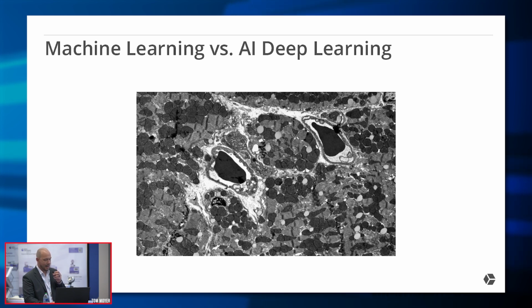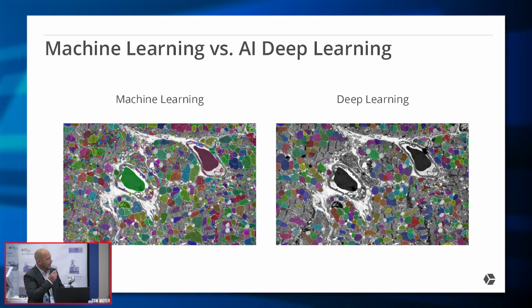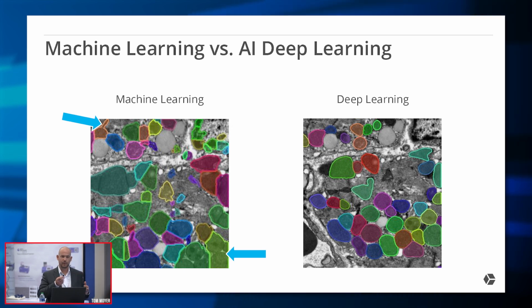Finally, we have a nuclei mitochondria image. And you can see from a distance, they look similar. It's because we have a lot of objects in this image. But if I were to zoom up, one of the struggles with machine learning is splitting objects. So even if we have enough contrast to identify the various areas within the image, identifying what is a single object when it is connected to a grouping of objects can be difficult.